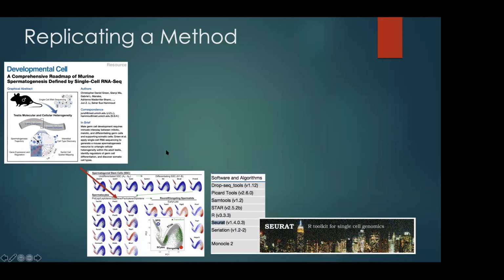So here it's single cell RNA-seq data. They have beautiful data, everything is beautiful, but the software versions they used at the time are listed here. I installed many of these versions, but some of them are not even installable today; they are version 3 or something. But they published everything they had about how they did the analysis from zero to the end.